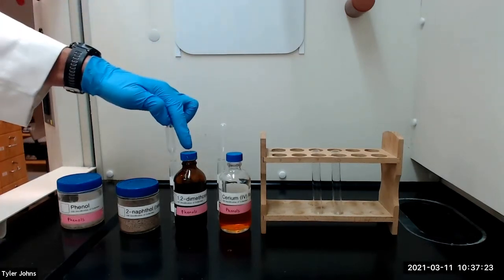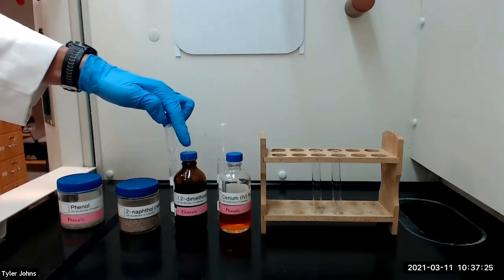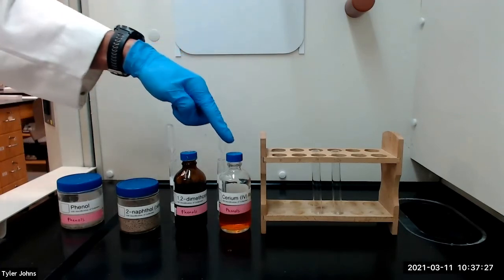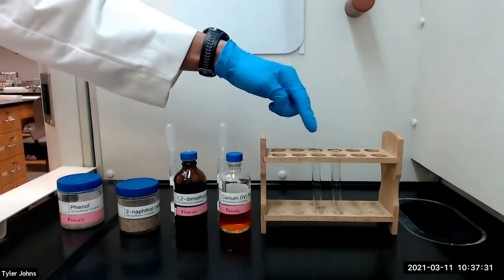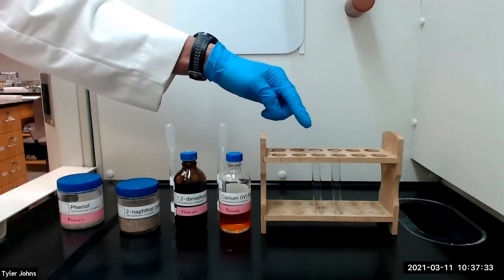We will begin by adding 3 milliliters of 1,2-dimethoxyethane and 0.5 milliliters of cerium-4 reagent to two dry test tubes and gently shake the solution to mix.